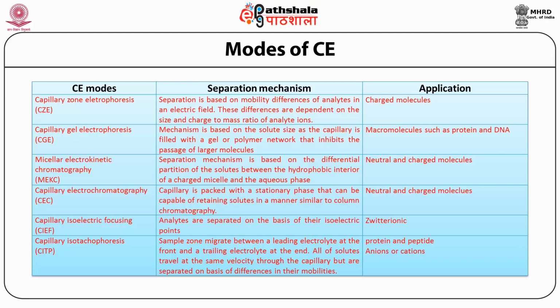I want to explain the table. In this table, we are going to discuss all the modes, their separation mechanism and application. Let us start with the first one, which is capillary zone electrophoresis, known as CZE. The separation mechanism for CZE is based on the mobility differences of analytes in an electric field. These differences are dependent on the size and the charge-to-mass ratio of the analyte ion. This can be used for separation of charged molecules.